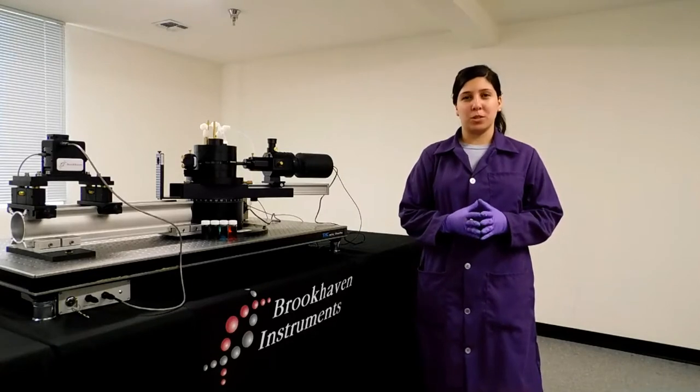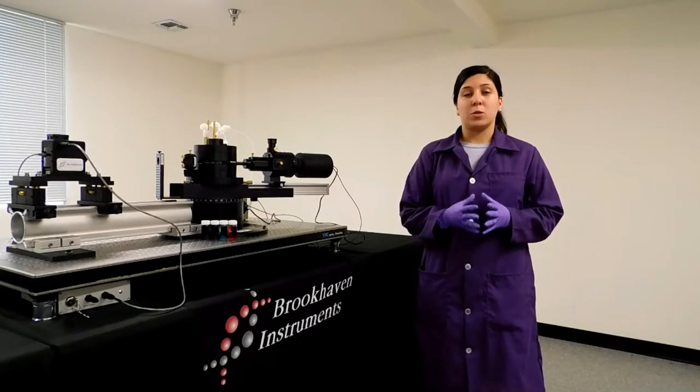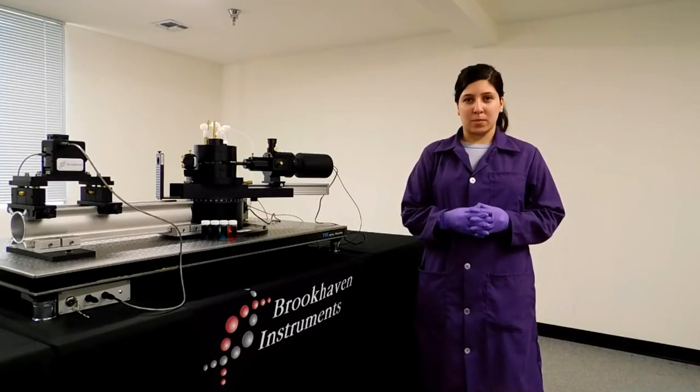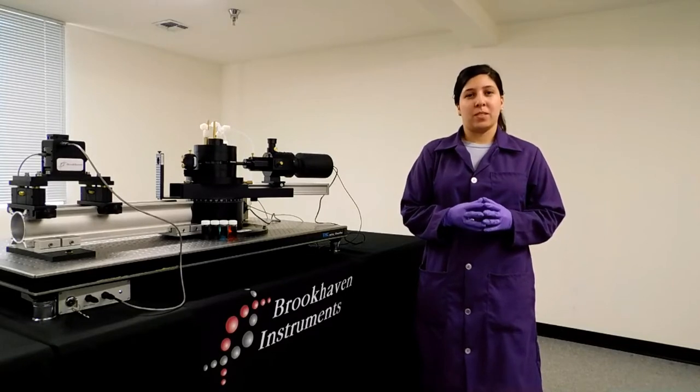This video will be appropriate whether you're setting up a brand new system for the very first time, or you're realigning your current system. If you do not have our most updated alignment manual, please contact us at info@brookhaveninstruments.com, because that manual must be used in conjunction with this video.